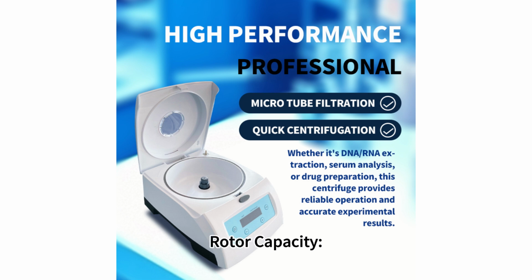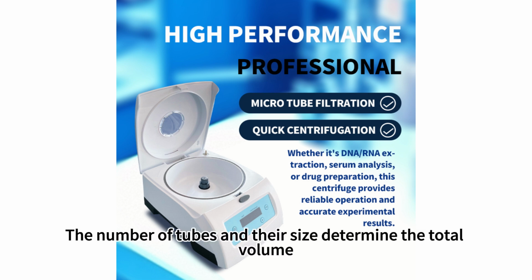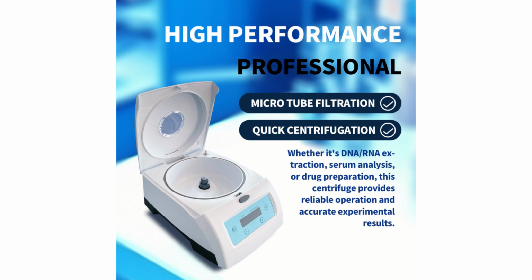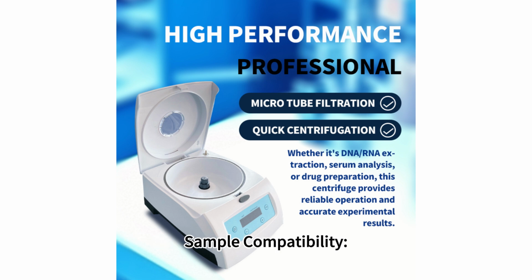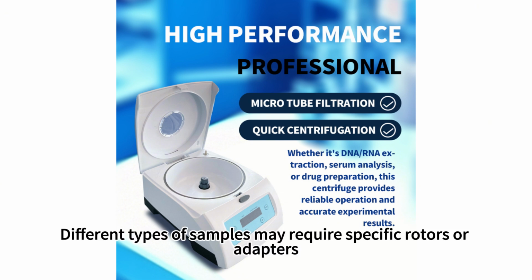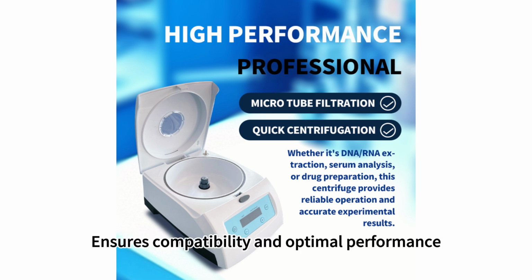Rotor capacity factor: the number of tubes and their size determine the total volume. Importance: affects the throughput and scalability of experiments. Sample compatibility factor: different types of samples may require specific rotors or adapters. Importance: ensures compatibility and optimal performance.